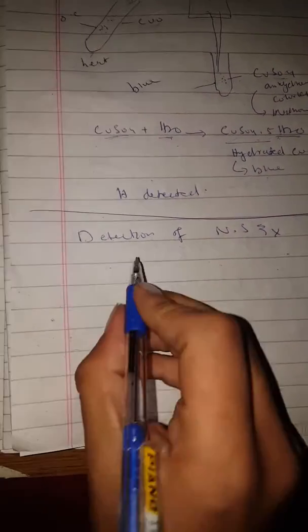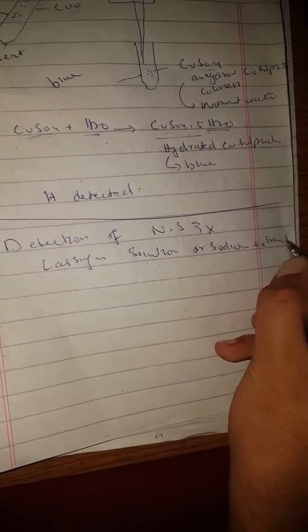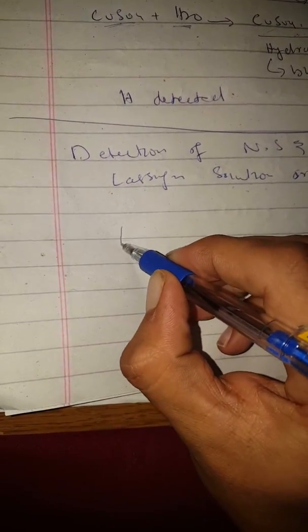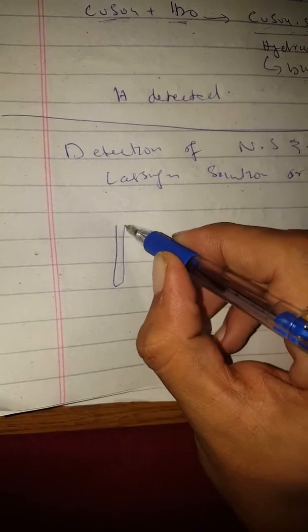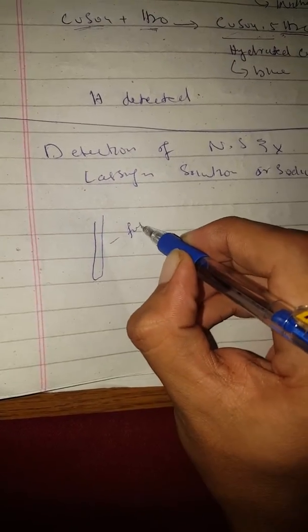My topic is Detection of Nitrogen and Halogen. I am going to use a solution for this. For this solution I am going to use a test tube — this diameter is lower than the normal test tube — we use a fusion tube.